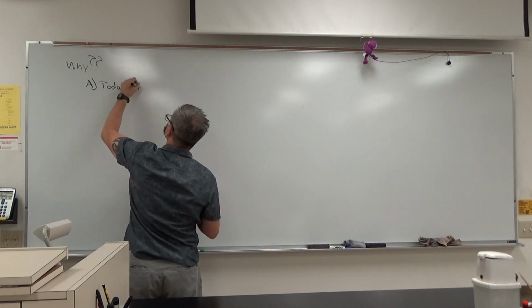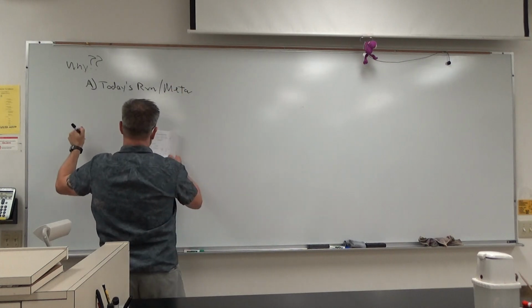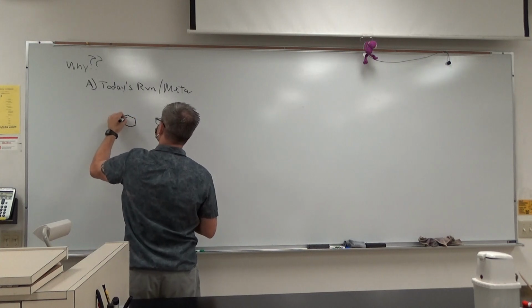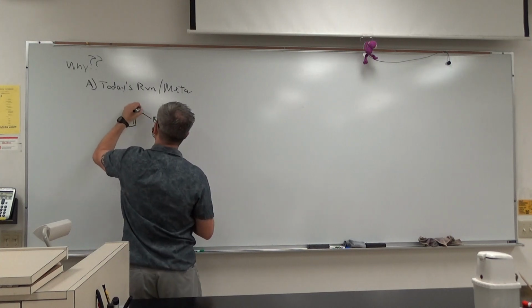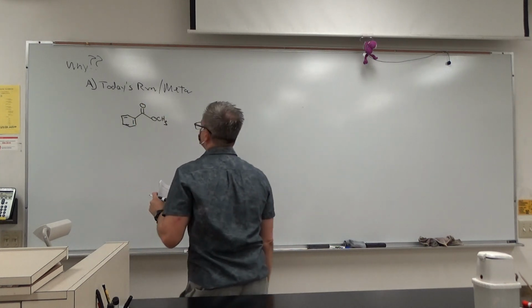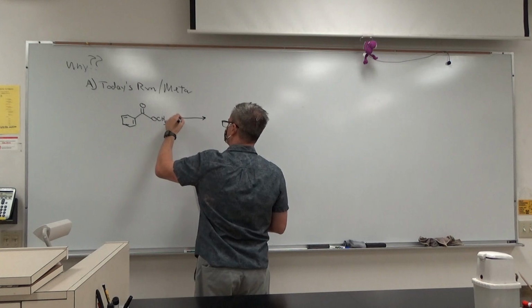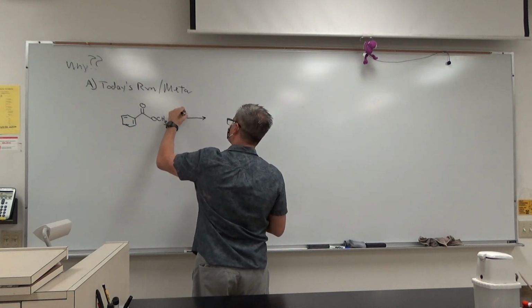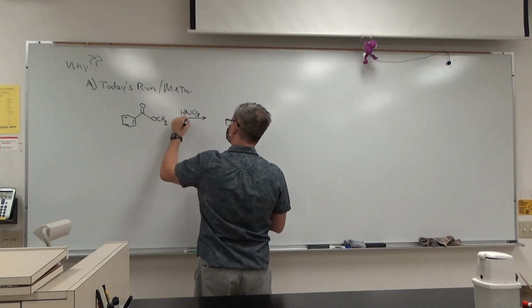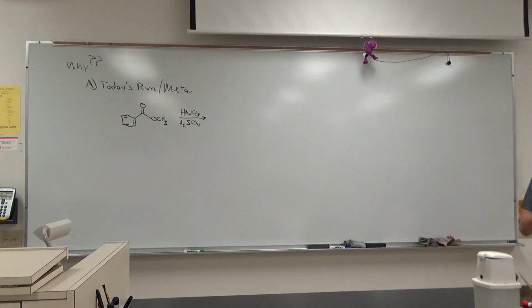Today's reaction is that of a meta director. So this is methyl benzoate. And our reagents. Before I forget, in your book it describes you mixing them. Here at HPU, your lab staff has gone through that trouble for you, so they are already mixed together.